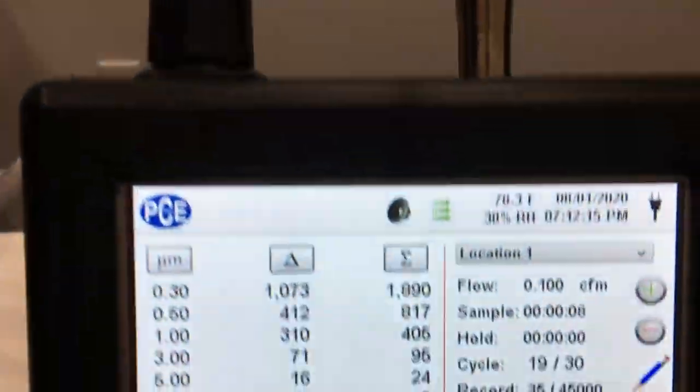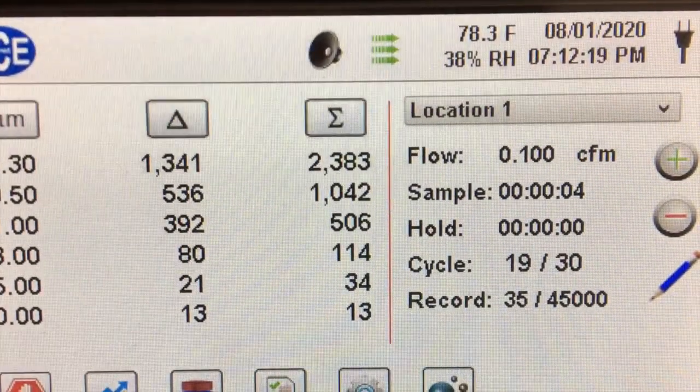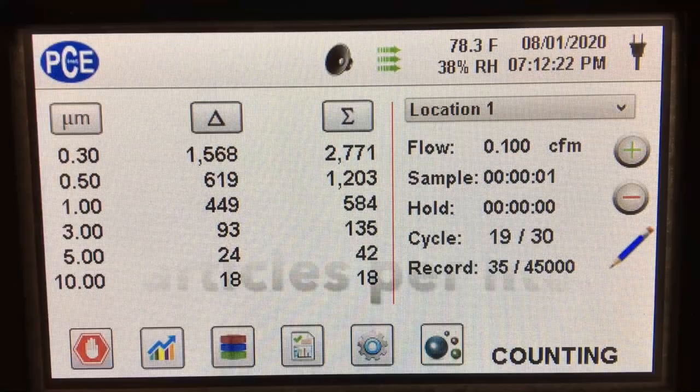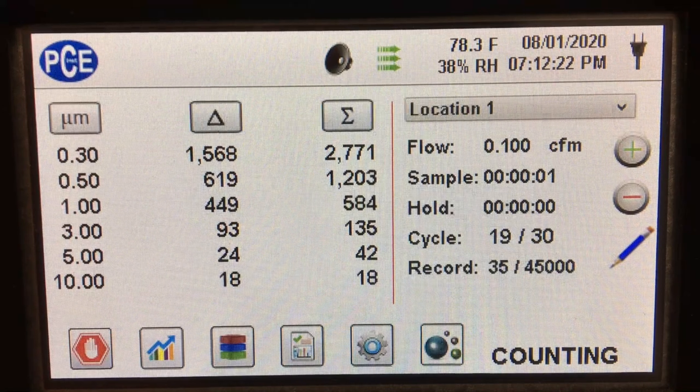We tested the mask nonetheless using the same setup as before, basically pulling the air from the outside first, and we measured around 1597.17 particles of 0.3 microns per liter over 30 tests.